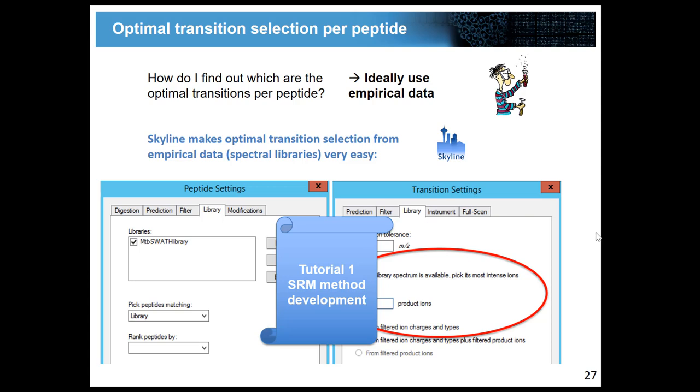Yes. I would like to add solubility also, like in the final matrix, if it is acidic pH, some peptides tend to precipitate, and you can predict those things prior to selecting those peptides. Because solubility is one factor which can give you a problem. So there is a good tool to predict whether it's soluble or not? Yeah. What is that tool? Tell me. Give it to me. I'm happy to use it. And that works well also? Yeah, it works well. Sometimes we order heavy labeled peptides and they are not soluble. It is based on ionization pattern. You can check if they are going to be soluble in acidic pH or basic pH.